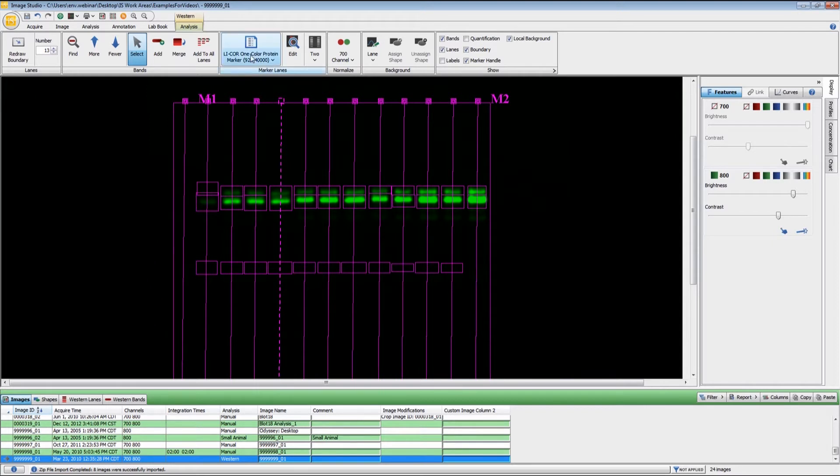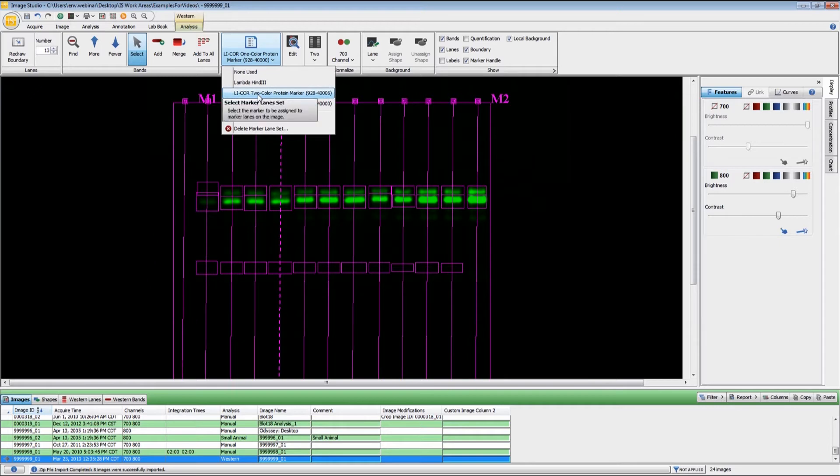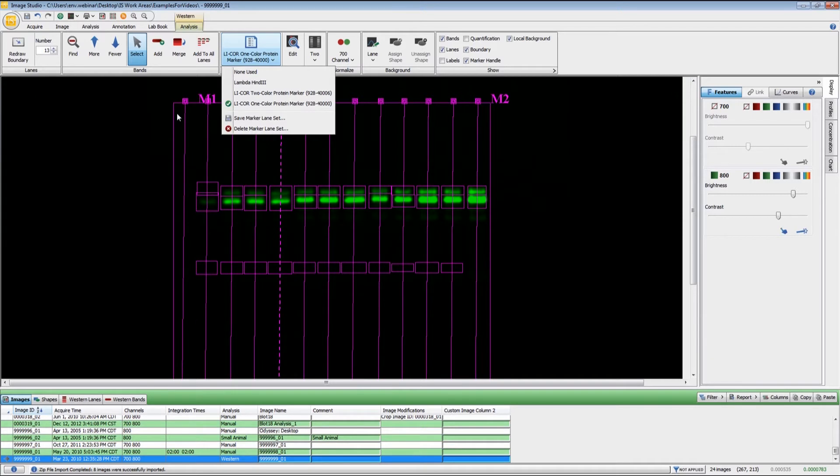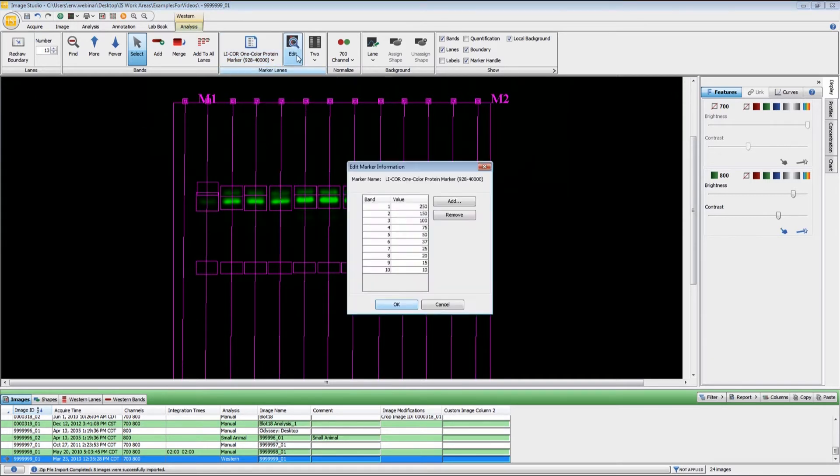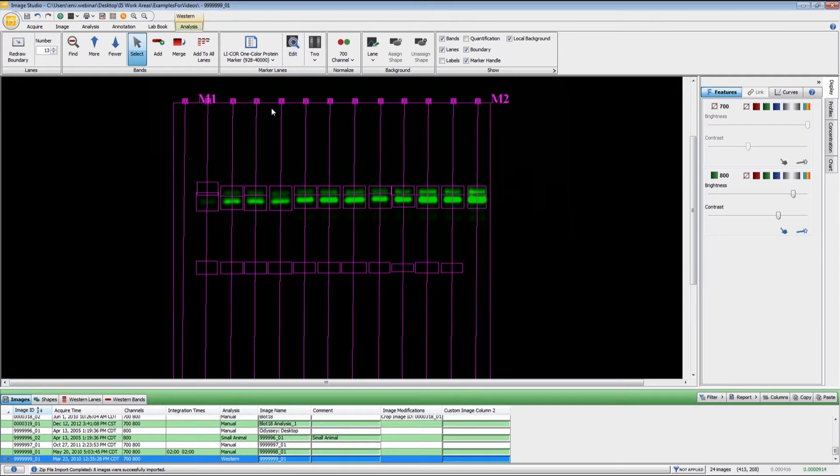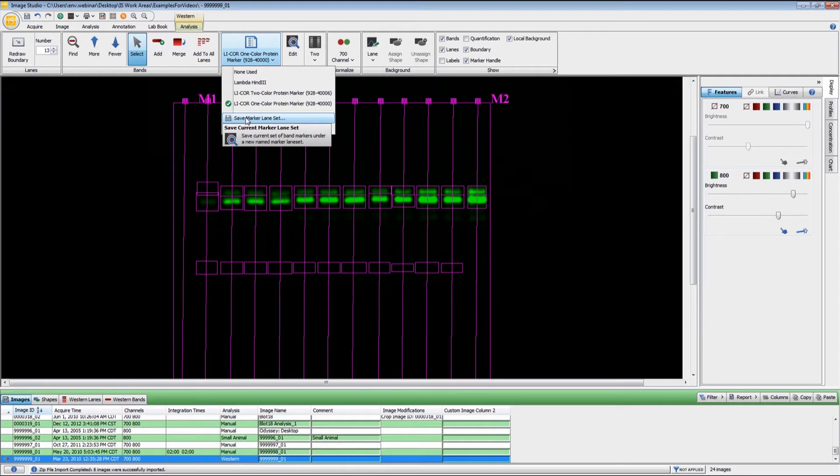For molecular weight markers, it comes preloaded with our one and two color markers, and I'm going to use the Lycor one color marker here. If you want to have your own marker sets, you can create new markers. The way that you do that is to click this edit button right here, and you can add and remove these as need be. Once you have created that custom marker set, you will save that as whatever name you want to give it.